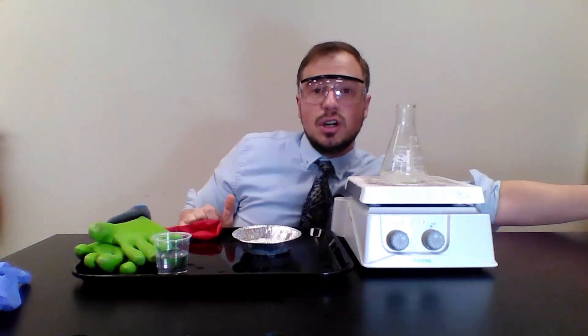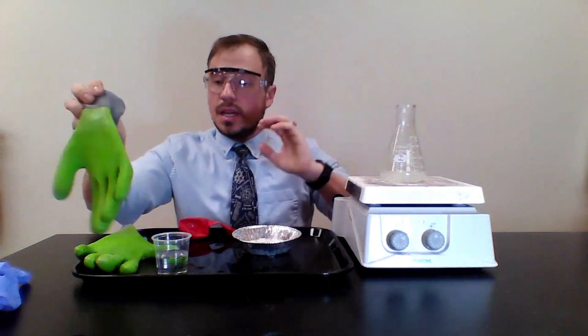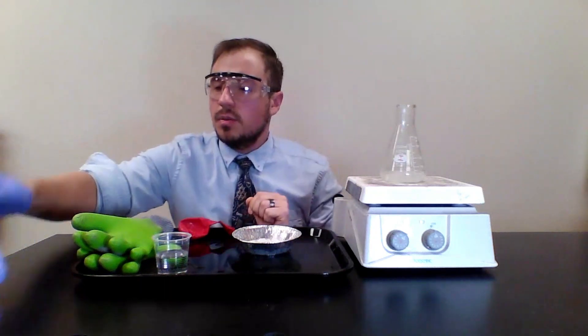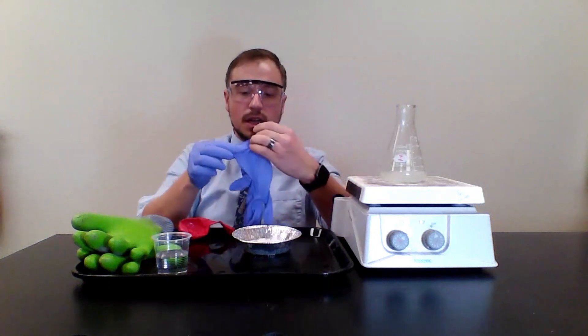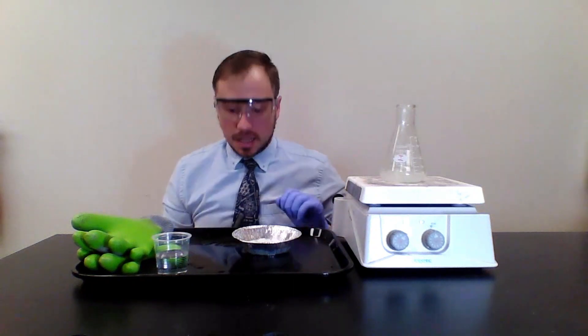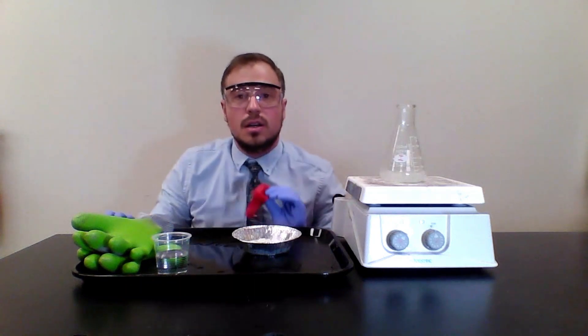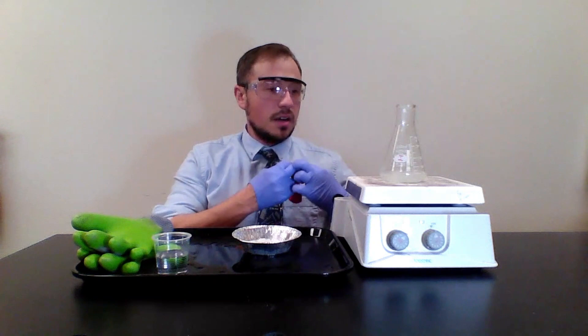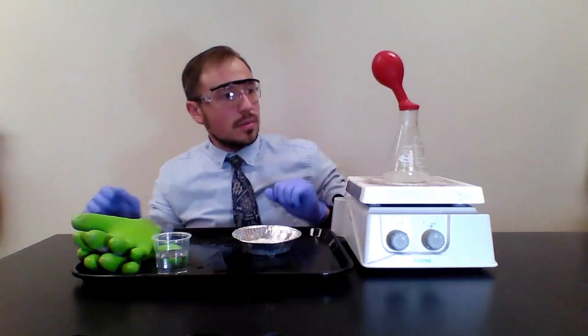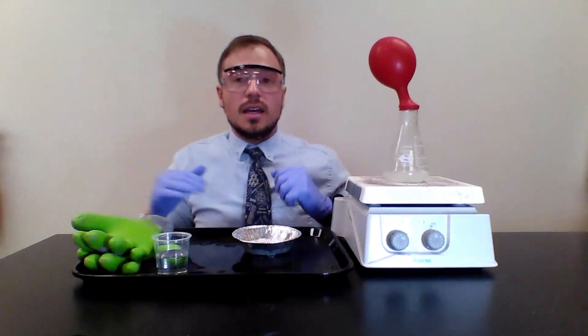Put the Erlenmeyer flask on the hot plate and let it boil — I started one earlier just for the sake of time. Now put the balloon over the top of the Erlenmeyer flask. It's a good idea to have a partner: one person puts on gloves and holds it in place while the other places the balloon over the top. Now we sit and watch — notice the balloon is getting bigger.